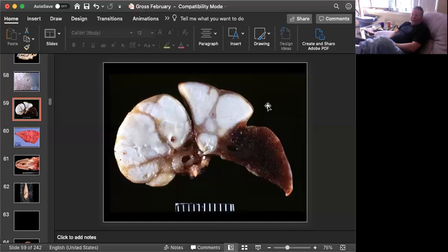Sometimes it precedes it, and you get tremendous bronchial or lymphoid cuffing and hyperplasia of bronchial associated lymphoid tissue. Sometimes it's after you get the pus. Nothing else looks like this. It's a great lesion. Just remember, mice and rats, Mycoplasma pulmonis.